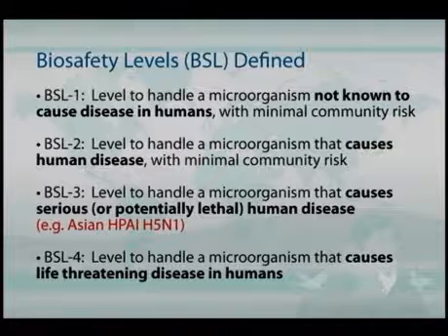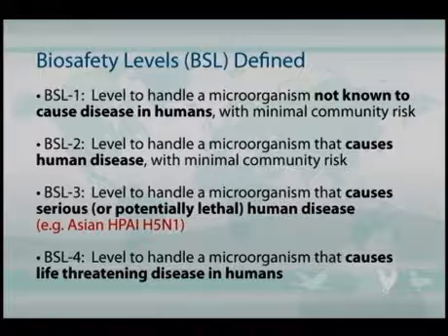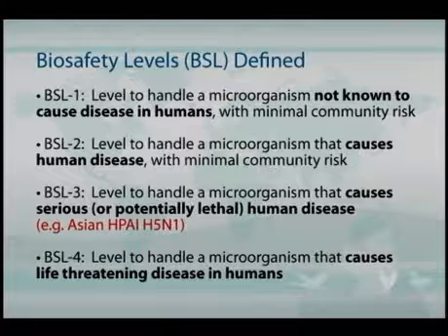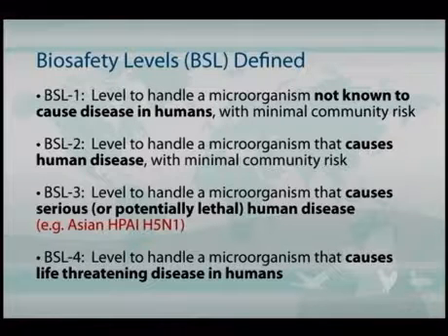However, if you're going to do virus isolation with the Asian high-path H5N1, then BSL-3 enhanced safety guidelines should be followed. And the highest level of containment is BSL-4, and this is a very stringent environment designed to safely handle microorganisms that cause life-threatening diseases in humans, such as Nipah virus or Ebola. Those would be a couple of examples.